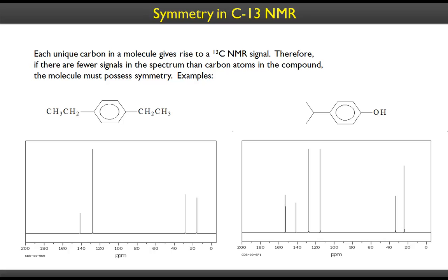As opposed to proton NMR spectroscopy, which is only from 0 to 10 and has a lot of splitting patterns, so proton signals overlap at times. However, carbon-13 is much more informative in the sense that you can observe all the chemically non-equivalent nuclei separately. They are spread out, and there is rarely overlap if their chemical shifts are not the same. Their chemical shifts are the same when they are chemically equivalent.